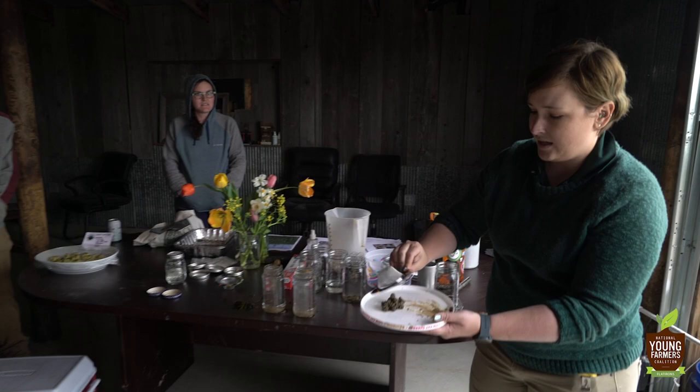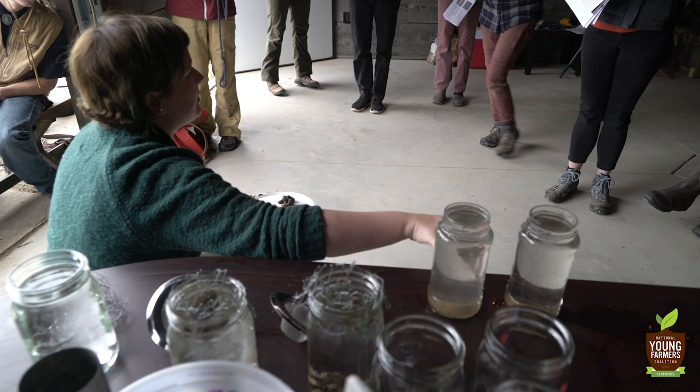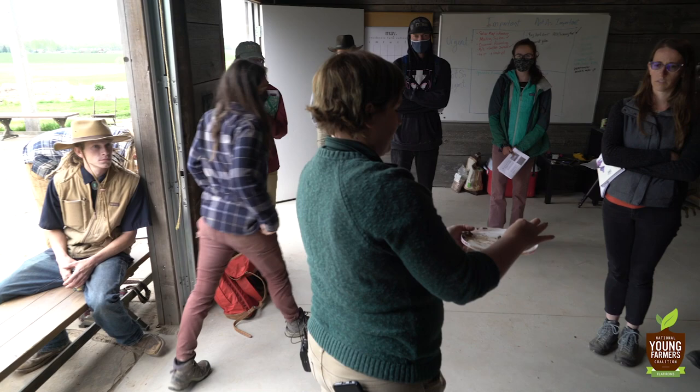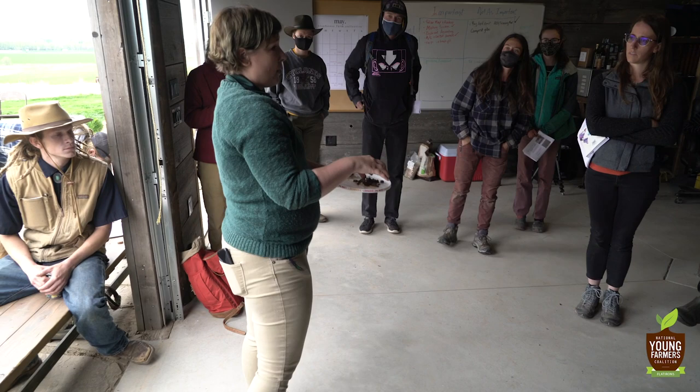And what we want to see is not a huge amount sitting at the bottom, right? It's a little bit tricky to see with these jars, but we do have a little bit more of those larger sediments, that sand, sitting from my beautiful front yard than we do from our nice field soil. And our nice field soil, it's sticking together, right? I have to actively push this apart. And that's part function of it being another clay soil, but part function that it has more stable water aggregates. So these would be considered large water stable aggregates.